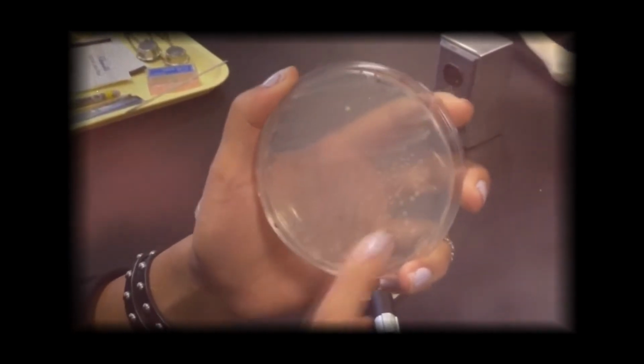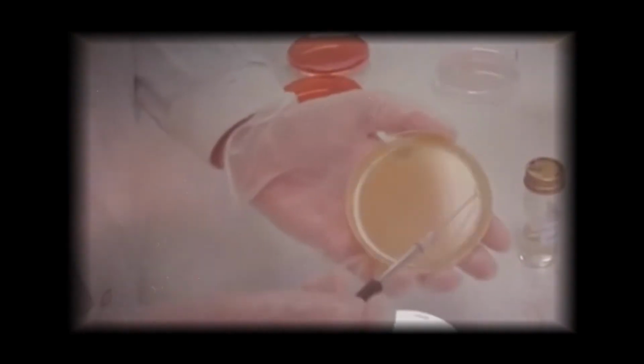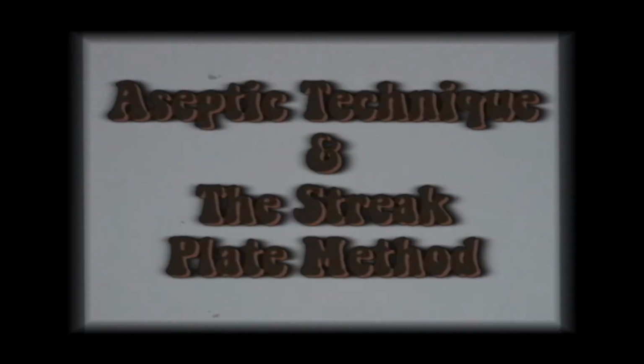With this, a mixture of cells is spread over the surface of a semi-solid, agar-based nutrient medium in a petri dish, such that fewer and fewer of the cells are deposited at points far away from each other on the medium surface, and after incubation, develop into colonies. Now, let us show you the proper way of doing these.